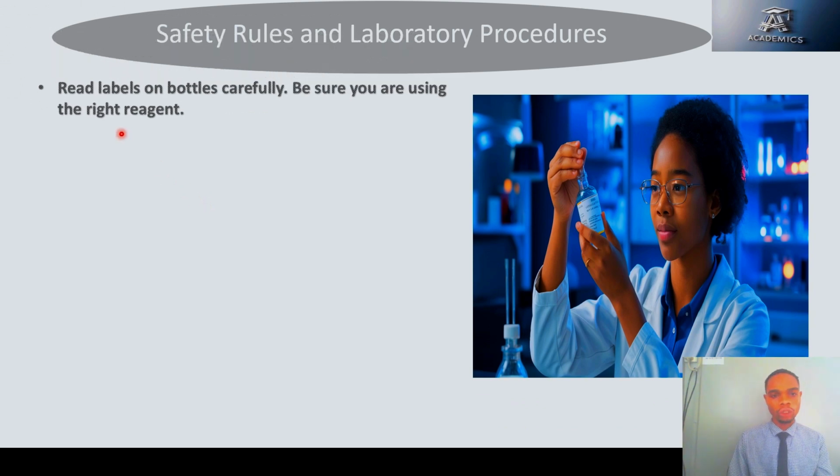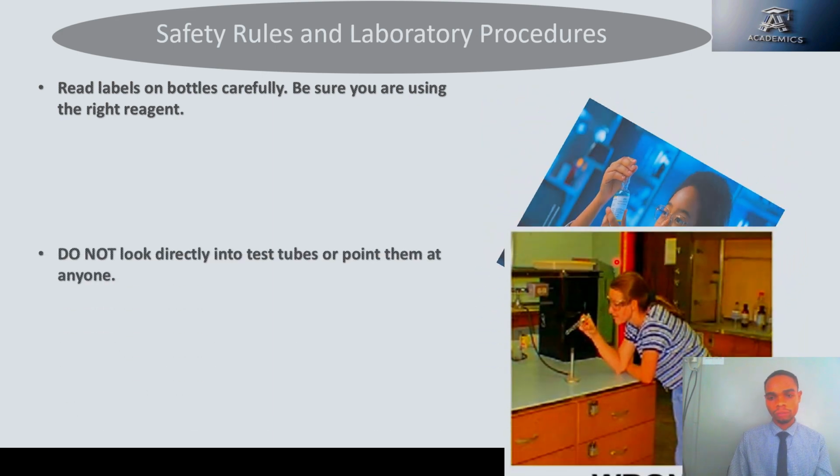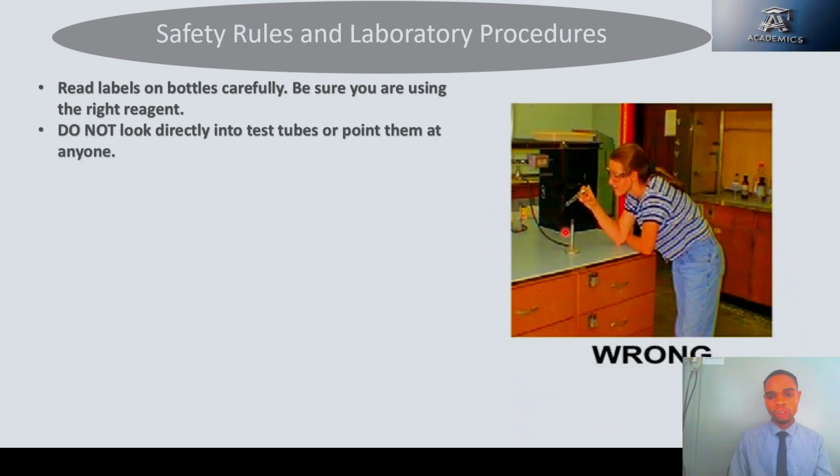So make sure you read the labels on the bottle carefully before you use it. You have to be sure that you're actually using the right chemical. And when you are heating, do not point the test tube directly at your face. The liquid inside might eject out and splash on your face, which will lead to burns.